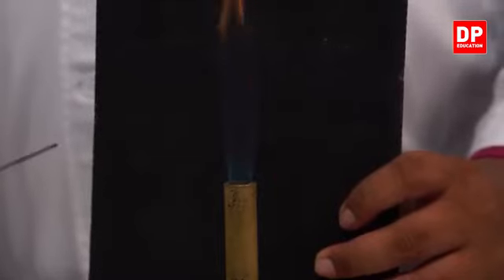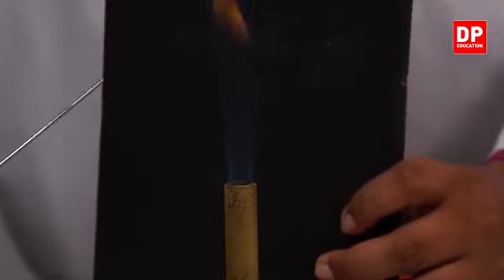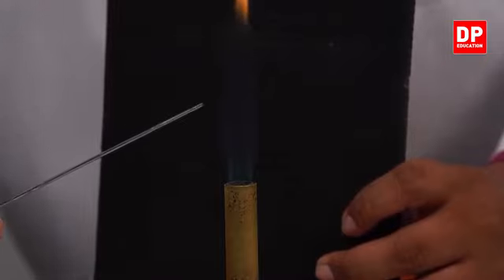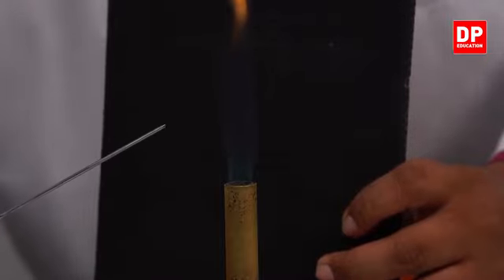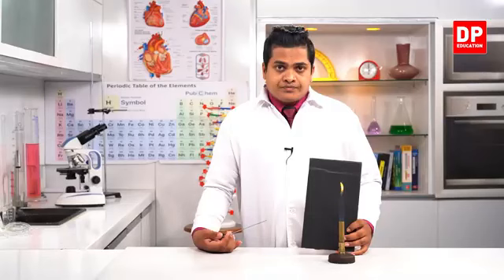Now let's observe what are the zones that we can identify in a Bunsen flame. So first of all, if you observe this area, which is the outermost layer in the Bunsen flame, you can observe the invisible zone.